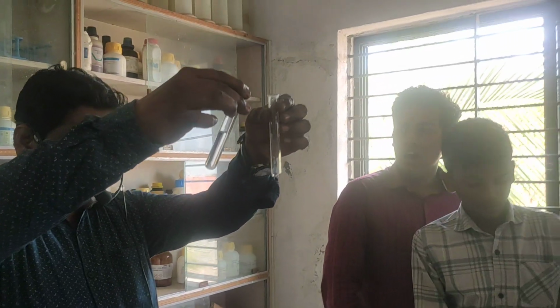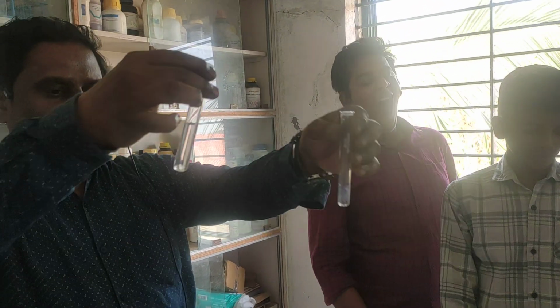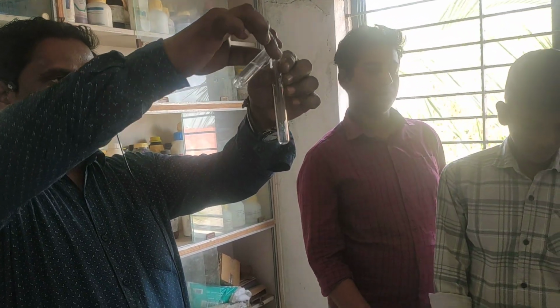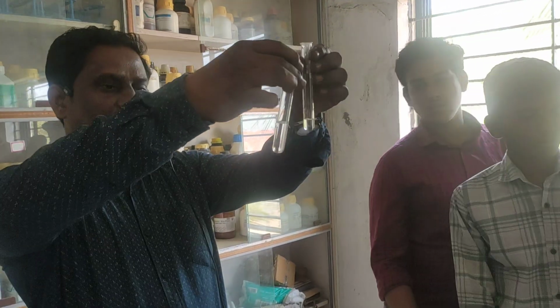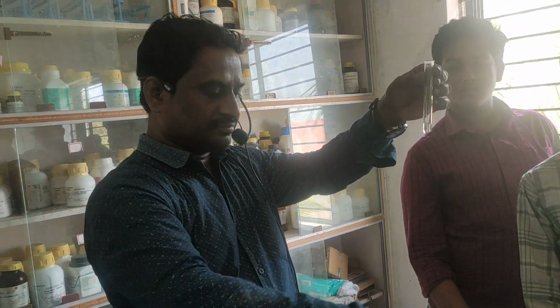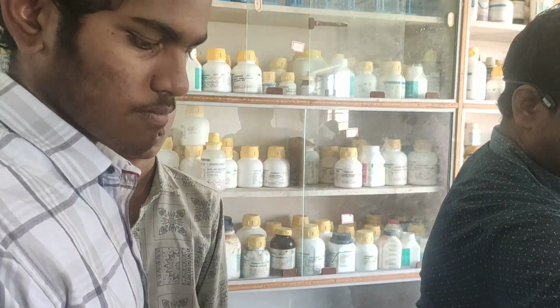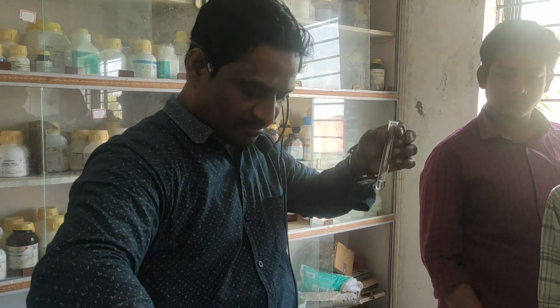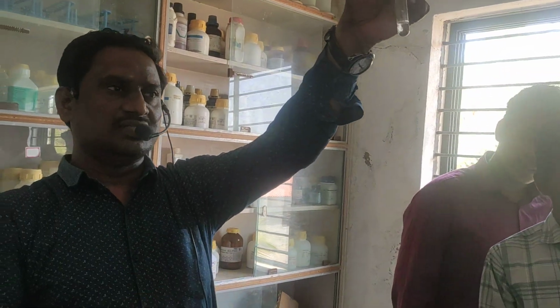Now we came to the conclusion. Now look at all of you carefully. Now ammonium carbonate, (NH4)2CO3, also take there. Now again I am taking the original solution, (NH4)2CO3. Right. Again look here, all of you. This is the original solution.